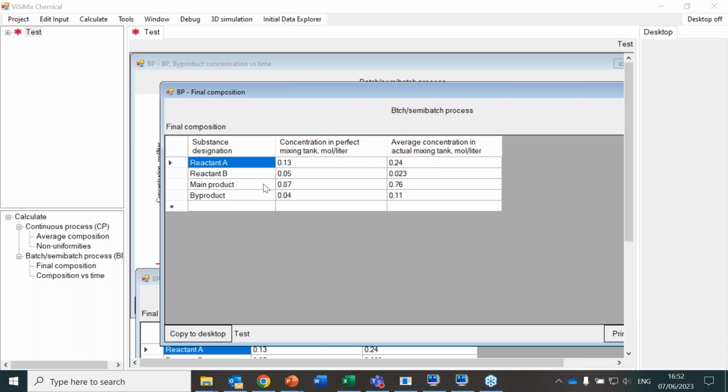Of course, all the environment you can see is now more available for people that are working in the lab, because with reactions, the capability to give feedback about the reaction is more common to what we are normally used to having in the lab. And in this way, every chemist will be able to answer about what was the environment he provided to the process in the lab.